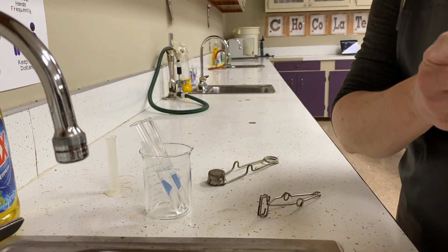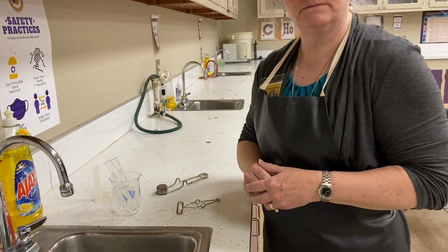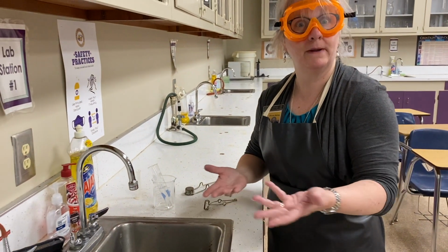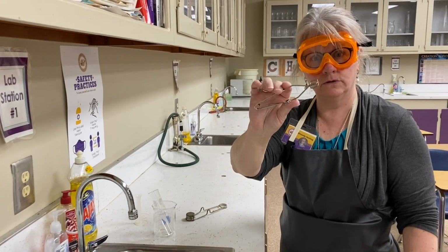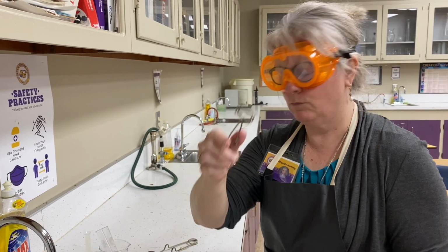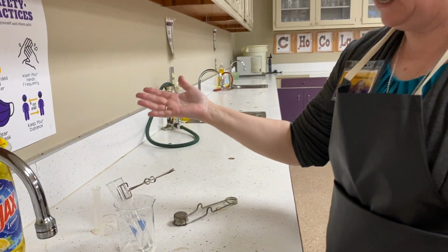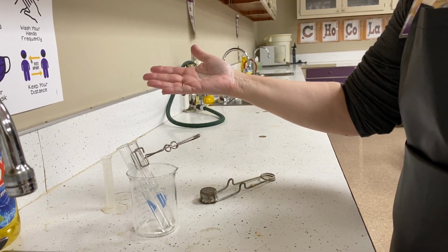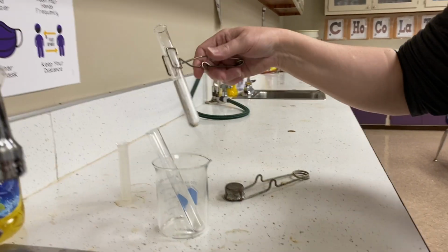I just need to do one test tube of water. I prepared two just in case. Maybe my partner can benefit from me preparing that. This is called a test tube holder. I push to open and shut, and it works on tension. So I approach the tube, I open it, and then I just let it go. It should hold itself onto the tube so that now I can lift it.